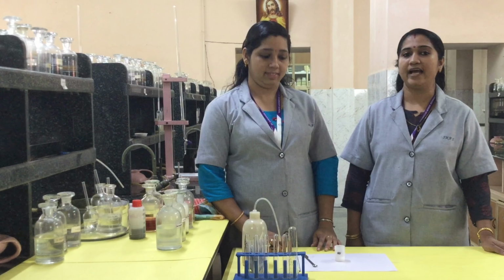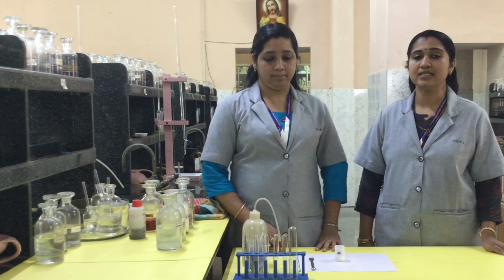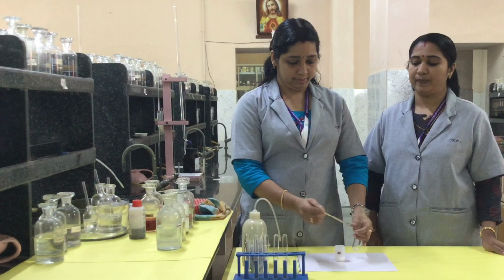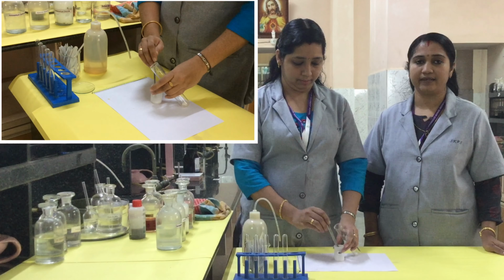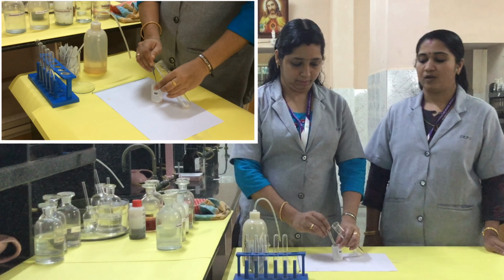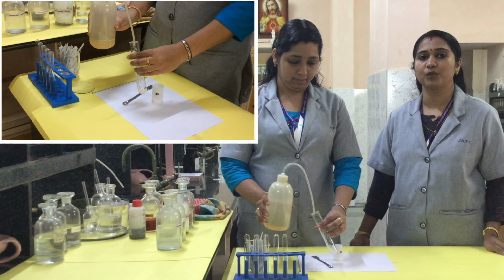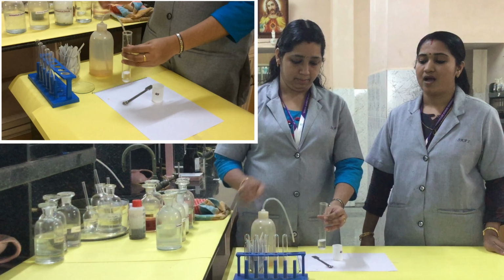Systematic test for the analysis of cations present in the salt. Before doing the experiment, you have to prepare the salt solution in a boiling tube and keep it aside. Here in this experiment, we will analyze group wise. First group 0, then group 1, group 2, group 3, group 4, group 5 and group 6.